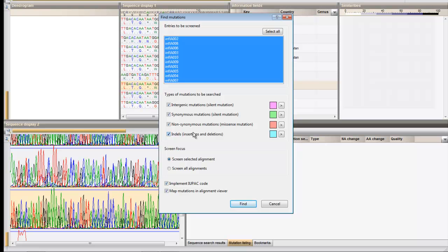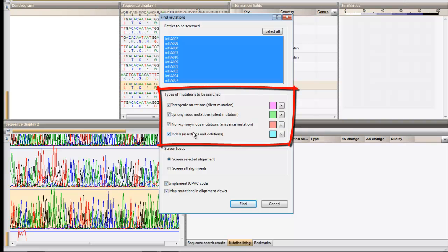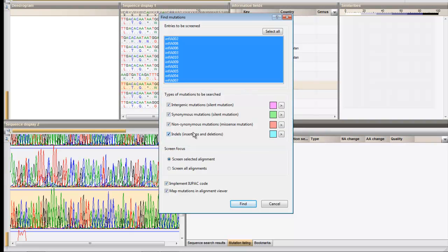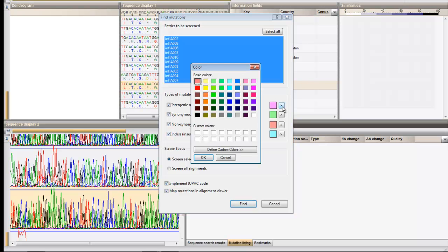By default, all present entries are highlighted to be screened. A checklist allows the types of mutations to be searched to be selected. Each type of mutation is displayed in a different color. This color can be adjusted by clicking the arrow button.